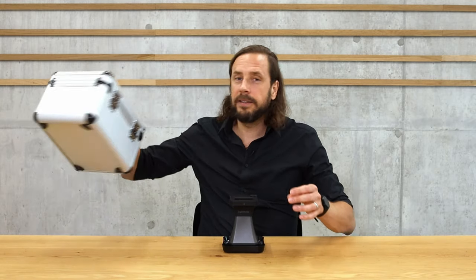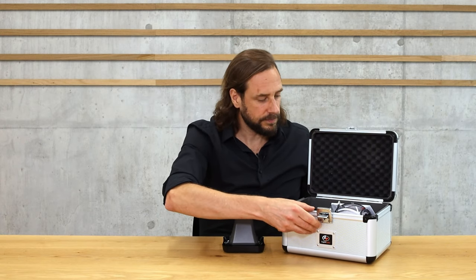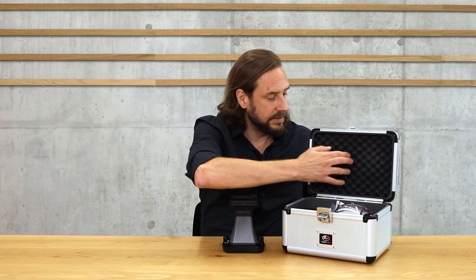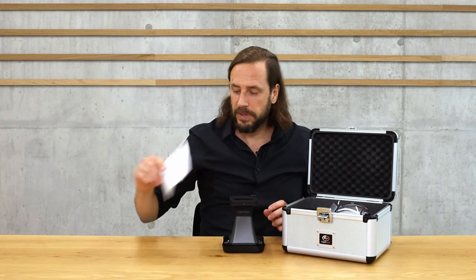The machine is super simple to use. I'm going to show you how it works, but first let me show you what comes with the device when you order it. Like all Lighthouse devices, the CM200 arrives in a strong, transportable, and quite light case. When you open the case, everything is neatly and securely protected for transportation, and it comes with a manual.